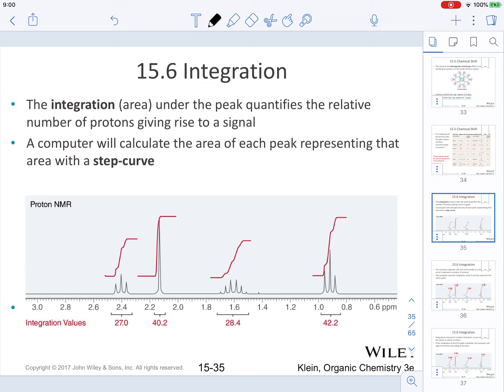Let's get started with integration. Integration specifically refers to the area under the peak that quantifies the relative number of protons present in a particular signal. As you can see from the bottom part of the slide, we have a proton NMR that has four different signals. The computer calculates the area of each peak and represents it with a step curve — that red curve drawn on each one of those signals.